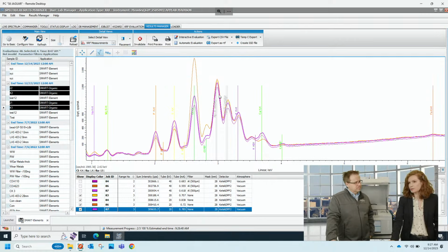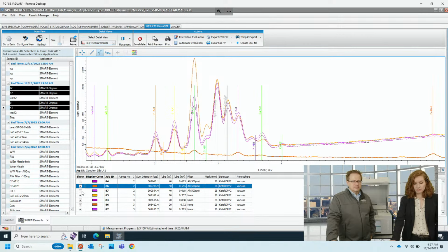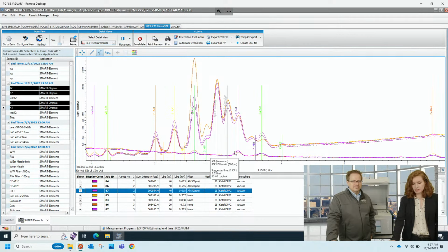I didn't mention this, but here in the middle we can see the tube lines, and that's what I mentioned before. There could be a filter in it, so we can take those out, the tube lines, if my software listens to me, right? And then we can see down here, yes, the potassium is really here, and we filter out those lines that come from the tube.